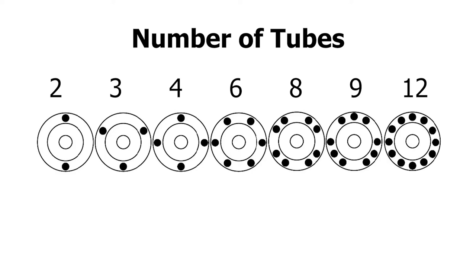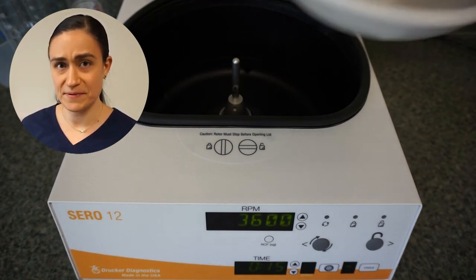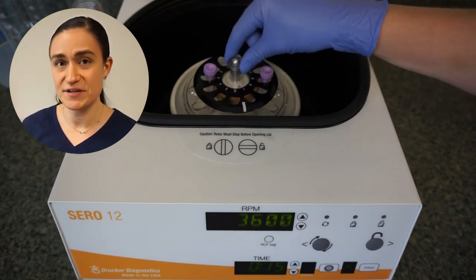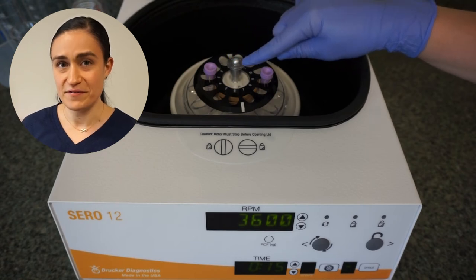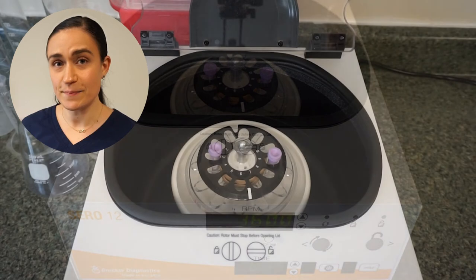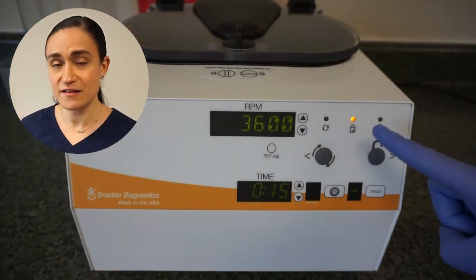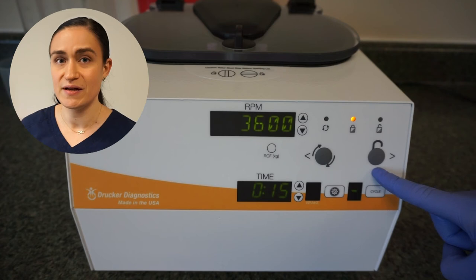If you don't have an even number of tubes — for example, if you're spinning just one tube — you can always use a counterbalance tube filled with water or something with a similar volume. If you loaded your rotor outside the SARA-12, place it back inside the rotor chamber now. Whether you loaded inside or outside, take a moment to make sure the rotor is properly seated on the metal shaft — you should just see the top of the shaft poking out above the rotor. Once it's properly aligned, close the lid and turn the latch a quarter turn clockwise to secure it. The lid lock will engage, and to access the rotor chamber again you'll need to press the stop/unlock button.